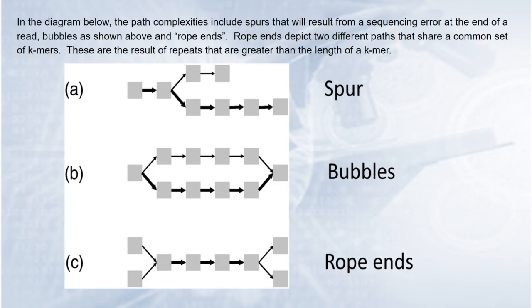But then they start to share KMers because there's a sequence that's represented identically or nearly identically in different parts of the genome. And so this is a case where repetitive sequences, transposons or recent gene copies, all sorts of things that lead to the repetitive nature of genomes, really wreak havoc on assemblies. And so these things, unless they can be resolved by other information, end up breaking the assembly and making it so that your contigs are on average shorter.